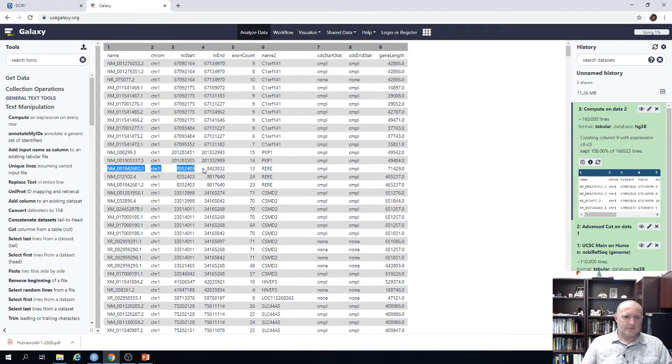So let's say, for example, if we look at this gene right here, the length of that gene should be, so it starts at, or I should say it ends at position 8,423,832. It starts at 8,352,000, right? So that's roughly a 70,000 base pair gene, right?